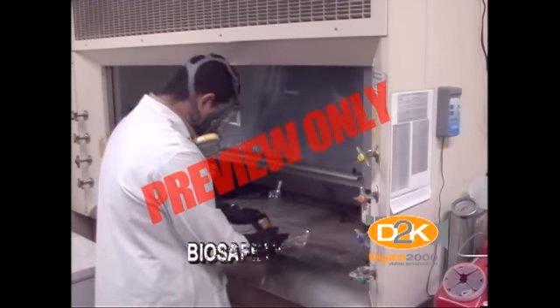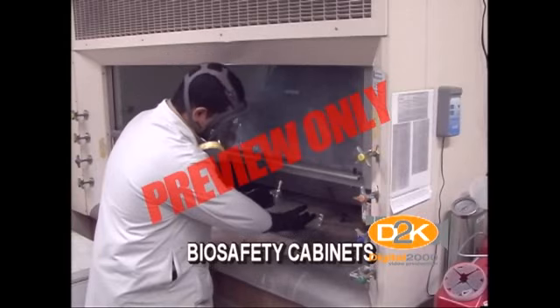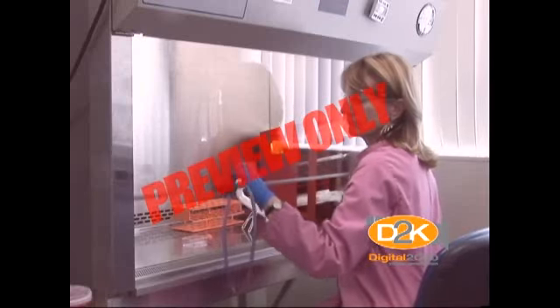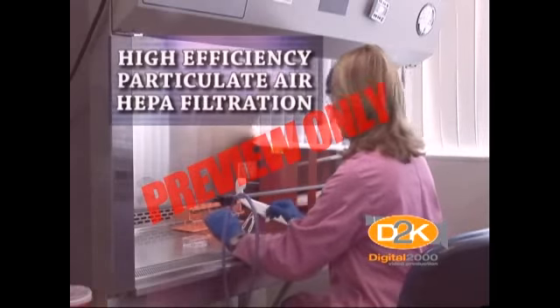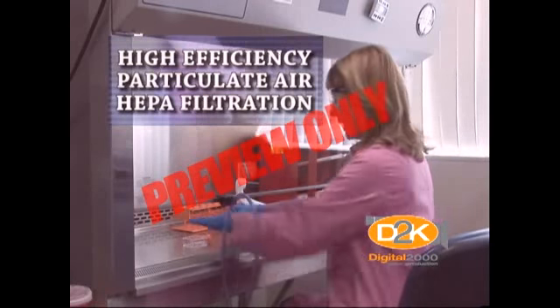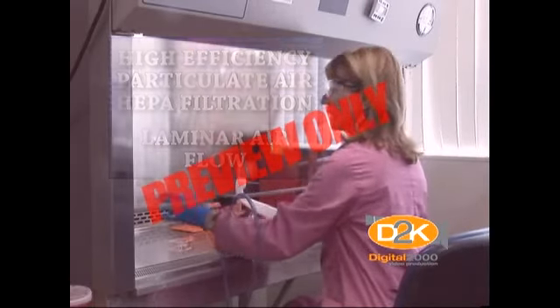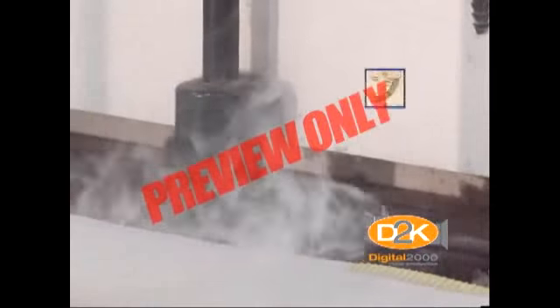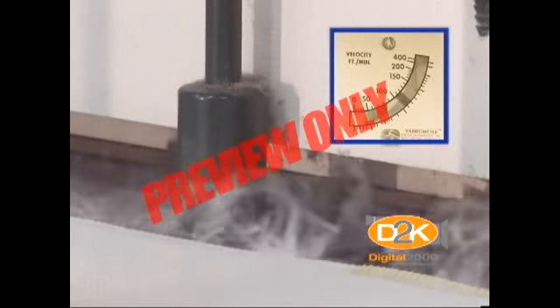A biological safety cabinet is a primary barrier against biohazardous or infectious agents. A biological safety cabinet is a ventilated cabinet which uses combinations of high-efficiency particulate air, or HEPA filtration, laminar airflow, and containment. Laminar airflow is air that flows with uniform velocity in one direction along parallel flow lines.